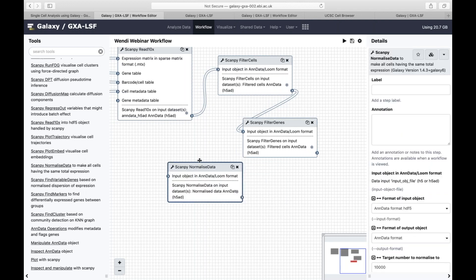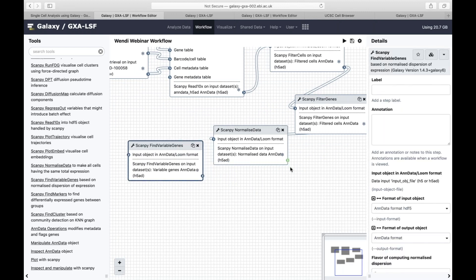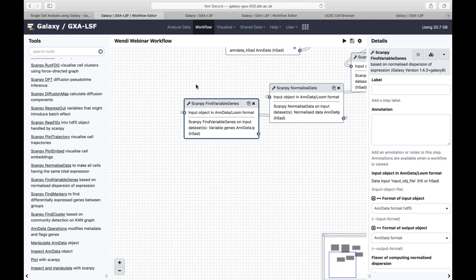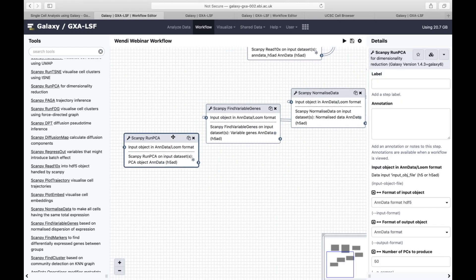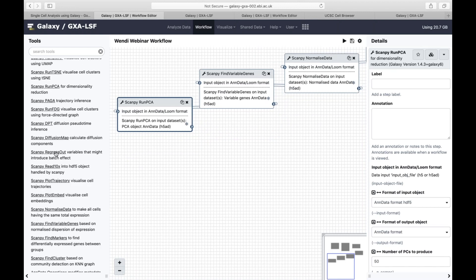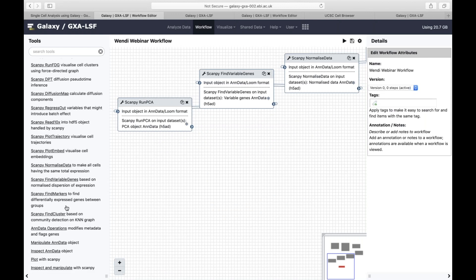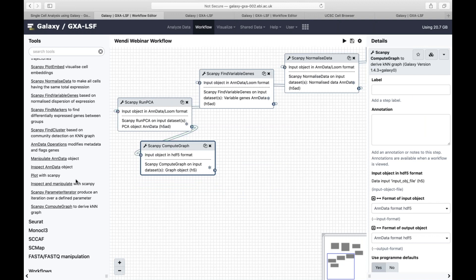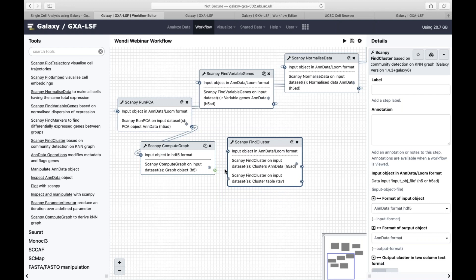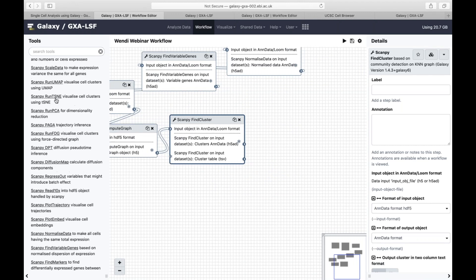We can normalize our data — again chain the arrow across — and then find variable genes. A lot of genes aren't doing much; we want to find the ones causing differences between cells and focus our analysis on those. Because the data is highly dimensional with many genes and many cells, we need to reduce dimensionality, so we run principal component analysis. You can also regress out different variables. Once we have our PCAs, we generate our graph, plot it, find our clusters, and then we get to the best bit: plotting a t-SNE.